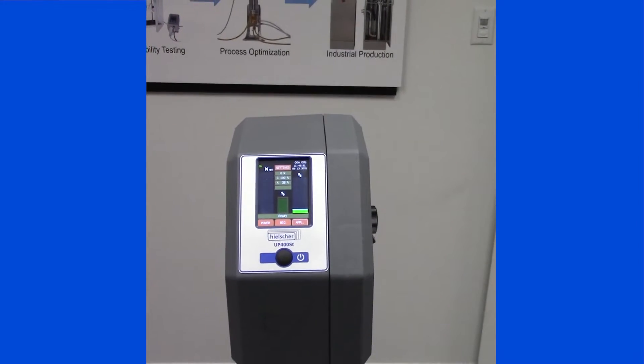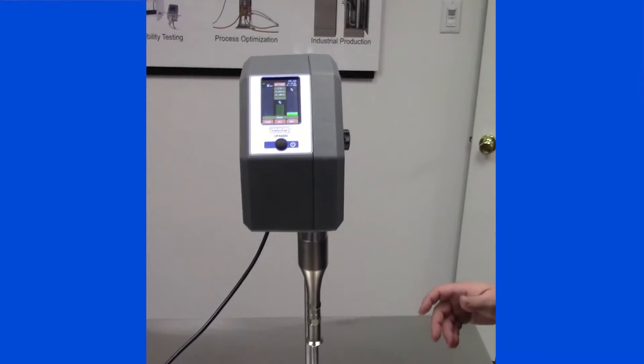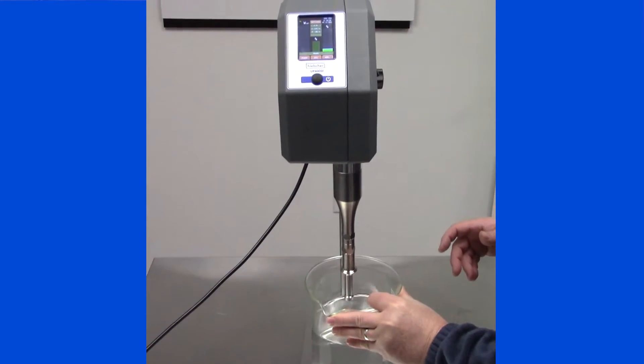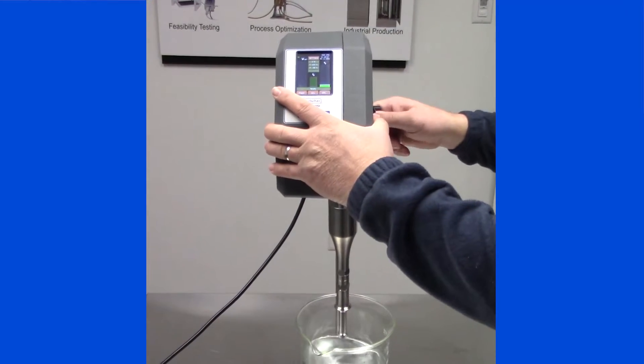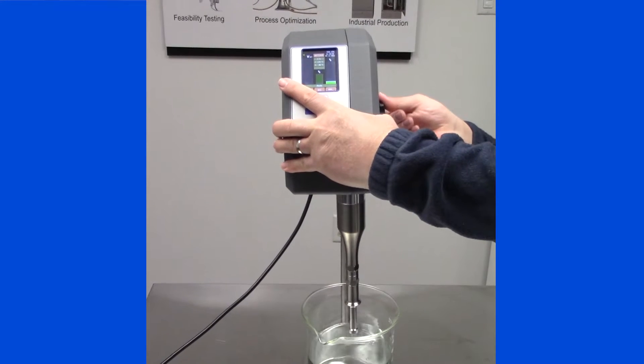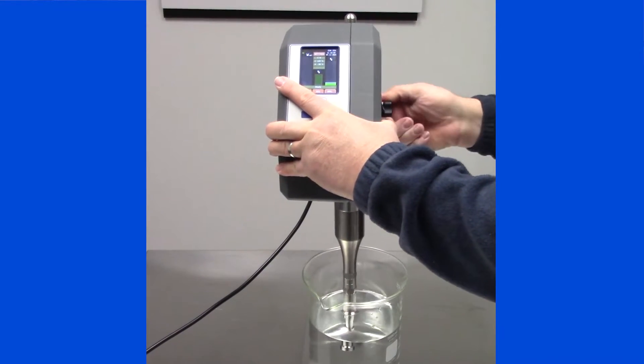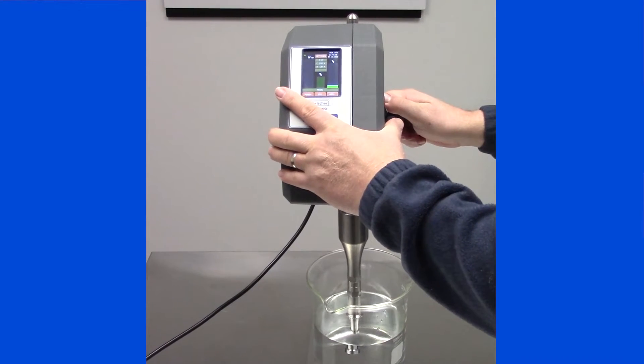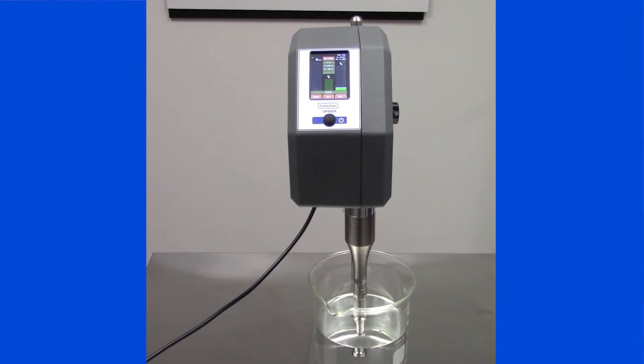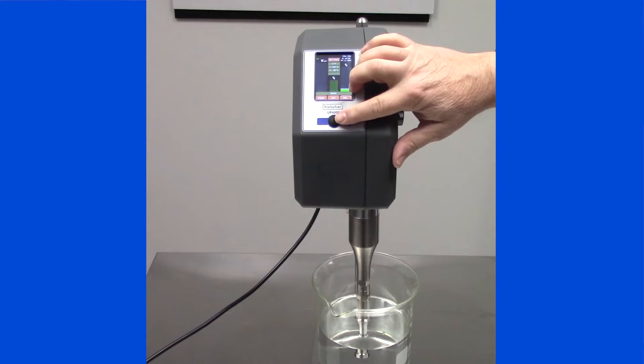We have some water that we're going to use today. I'm going to turn the unit on by depressing the button.